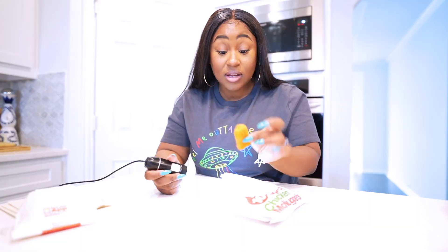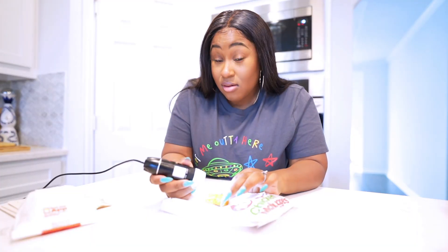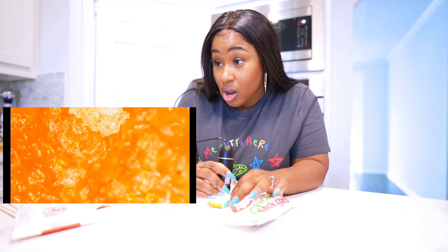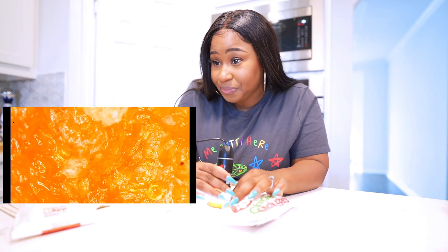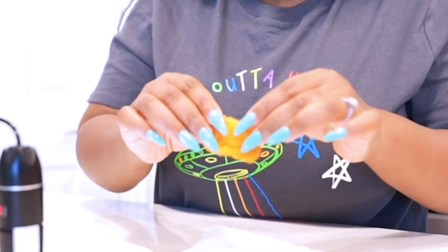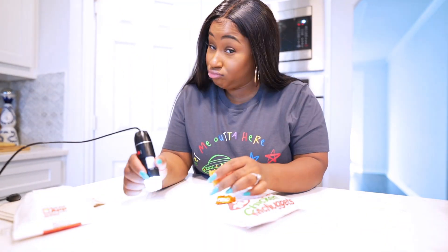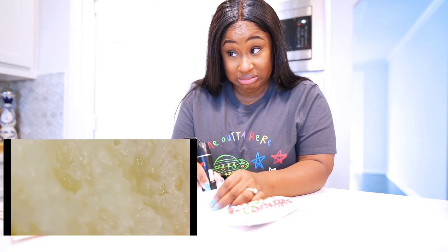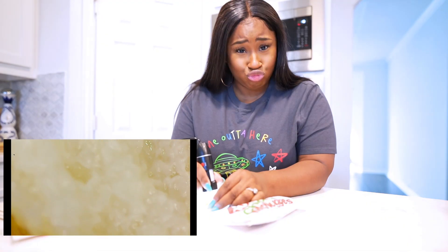Alright, now it's time for the spicy chicken nugget. Let's see. Okay, I think that's salt right there. Once again, the grease — it's clear. Let's take it a step further and break it open — let's look at the meat. What is that? Hmm, that don't look like chicken. That don't look too pleasing to me.